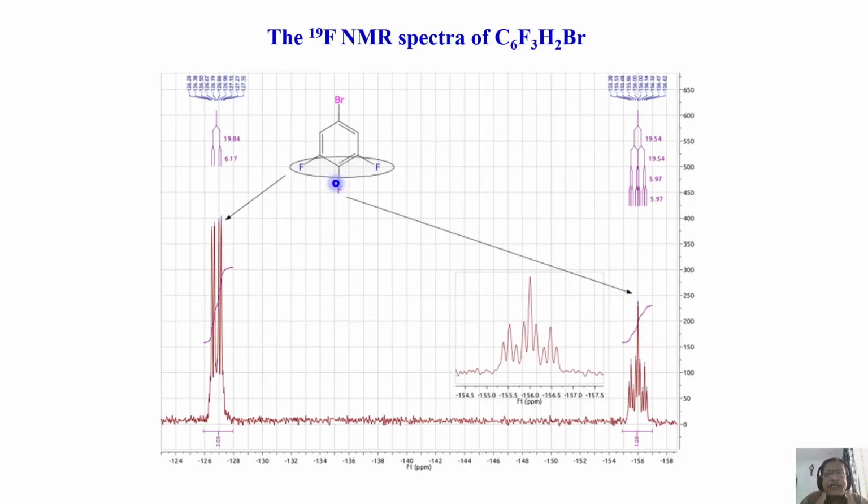Because both the couplings are equal. We remember we worked out the multiplicity pattern. When both the couplings are equal, the central lines of the two doublets overlap. As a consequence, it appears like a 1:2:1 triplet. Exactly, it appears like a triplet.